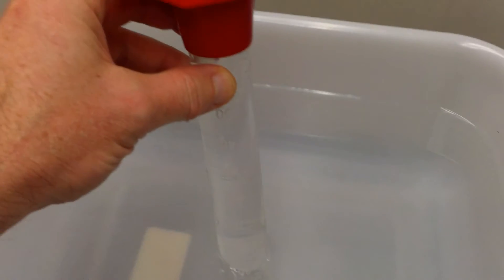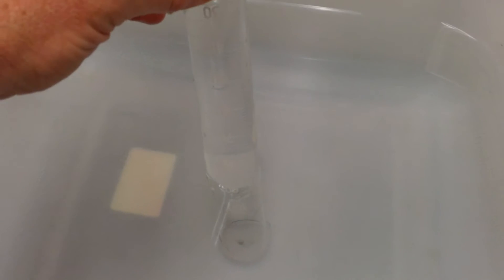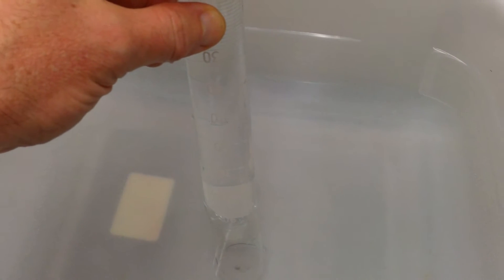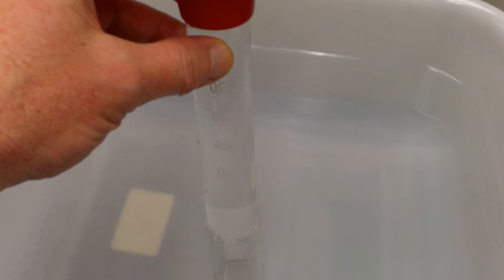We can see the graduated cylinder has been filled with water. The reason it's not emptying out is that if the water were to empty out, something would need to fill that space — a gas. But since the gas can't travel through the water, it would create a vacuum pulling the water back up into the graduated cylinder.